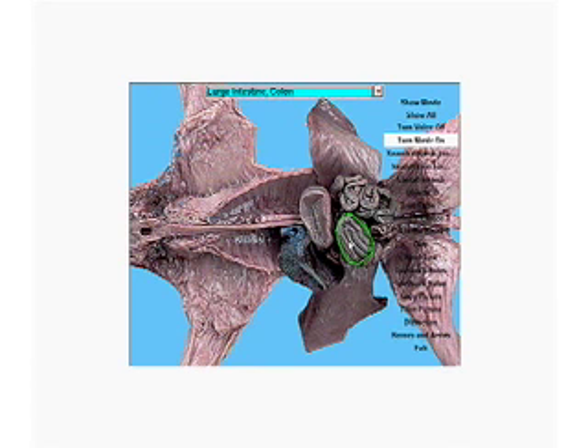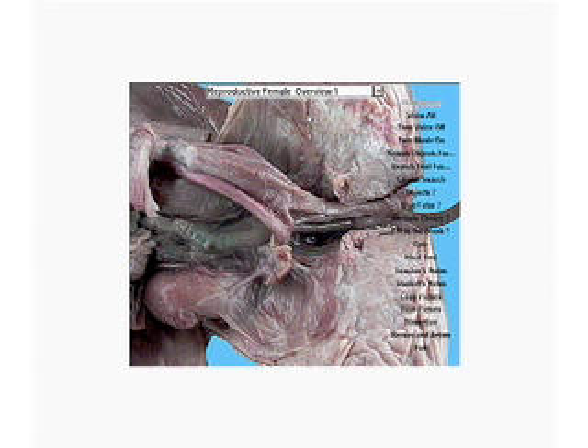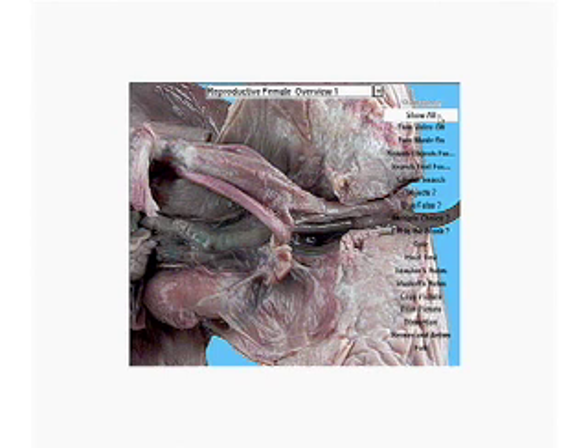Let's take a look down in the pelvis. The female pelvis is actually a very complicated place — there's lots going on. This is her umbilical cord, so her head's up here and this is her tail. Look at all the structures labeled in the female pelvis — it can be a little daunting. I start with the big things that are most recognizable. If this is the umbilical cord, then this must be the urinary bladder, and these are the paired umbilical arteries on either side. I recognize poop when I see it — Rectum. And these are the paired kidneys. This is the female reproductive tract, so this knob is the ovary. To a human doctor, this tubular structure next to the ovary looks like the fallopian tube, but it's the uterine horn — horn of uterus. This is a pig.